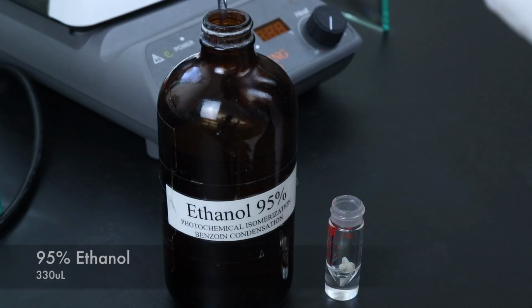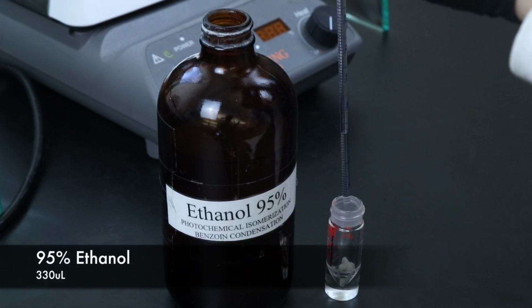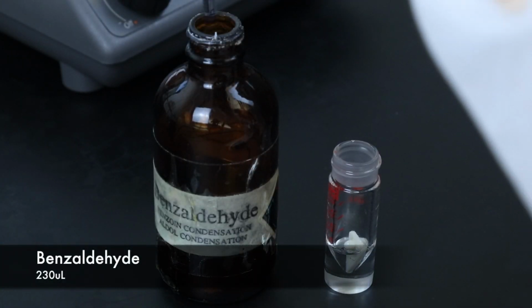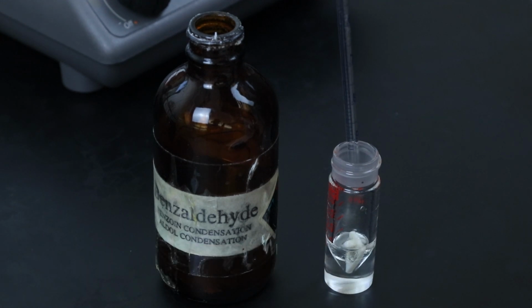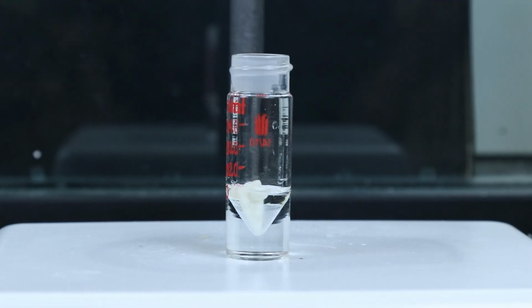From there, I'll be adding 330 microliters of 95% ethanol and 230 microliters of benzaldehyde. I'll start mixing those two phases together, and because ethanol is miscible with water, this allows benzaldehyde to interact with the thiamine, where otherwise benzaldehyde wouldn't be able to interact well with anything in the aqueous phase.